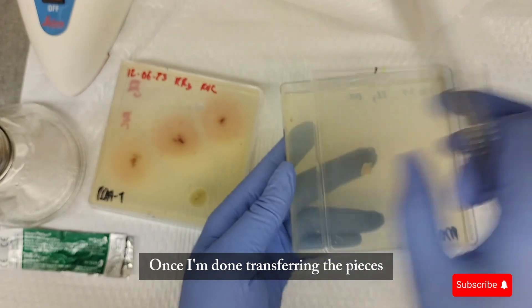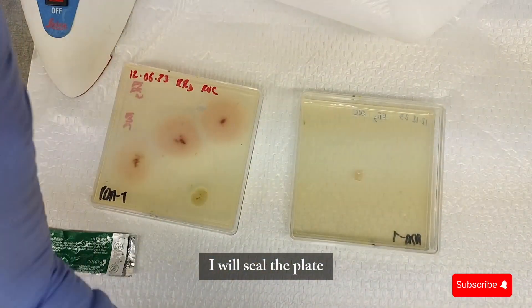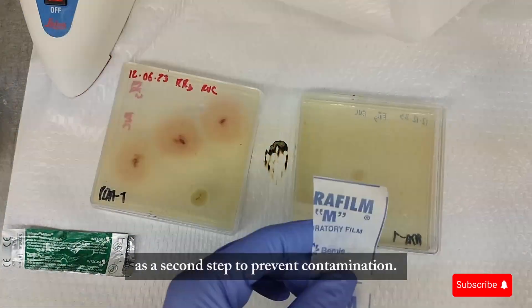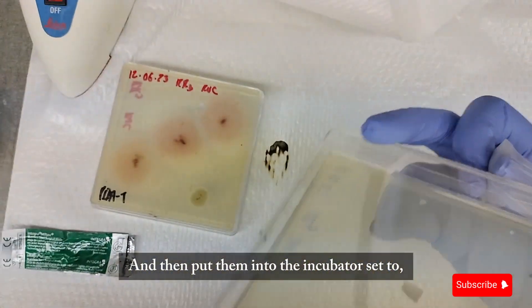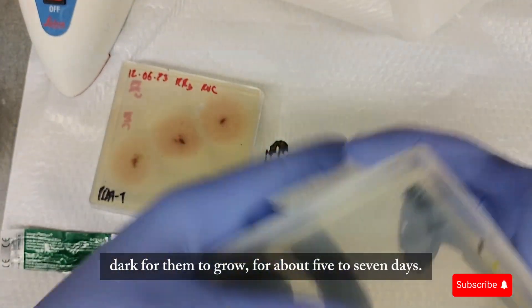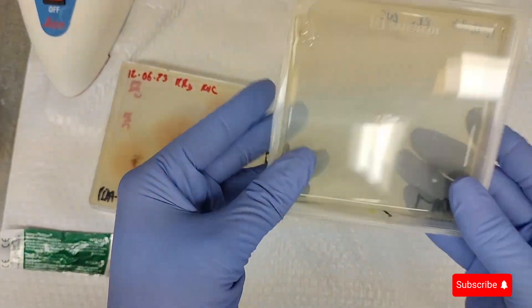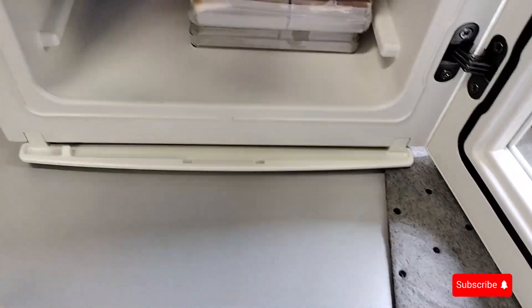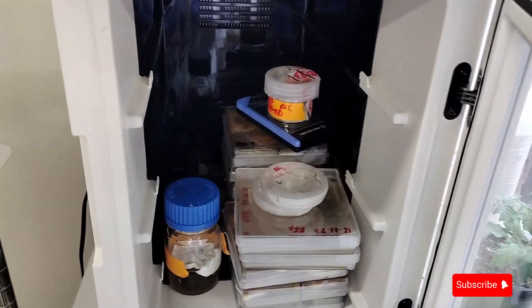Once I'm done transferring pieces from the old plate to the new plate, I'll seal the plates with Parafilm, then wrap them in that stretchy plastic material as a second step to prevent contamination. I'll put them into the incubator set at 25 degrees Celsius in the dark for them to grow for about five to seven days.